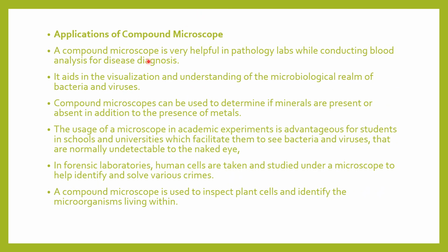Applications of compound microscope. A compound microscope is very helpful in pathology labs while conducting blood analysis for disease diagnosis. A pathology laboratory is a specialized medical facility where various biological samples like blood, tissue, and body fluids are analyzed and diagnosed for disease, and it guides treatment. So here we use the compound microscope for conducting blood and various disease analysis.